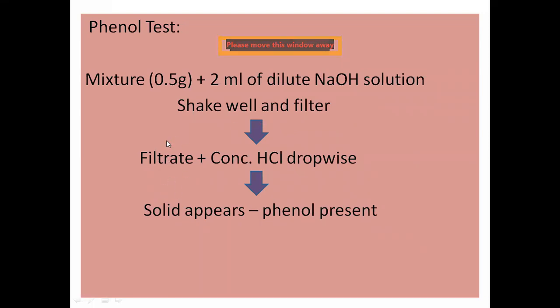Your filtrate. And then in that filtrate you add this concentrated HCl. Here you are regenerating the phenol. So if phenol is present, when you add this concentrated HCl in the filtrate, you will get the solid. If phenol is present, then you will get the solid.